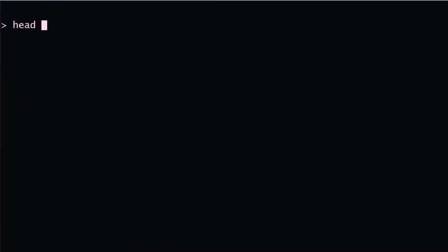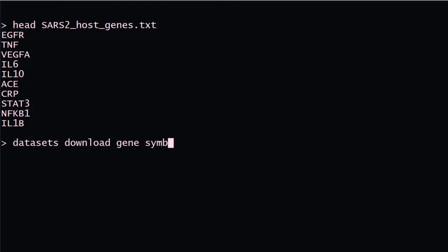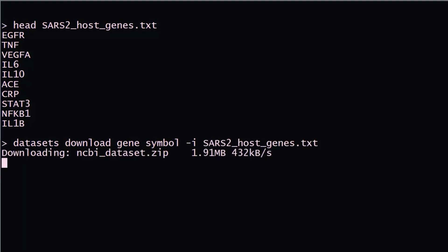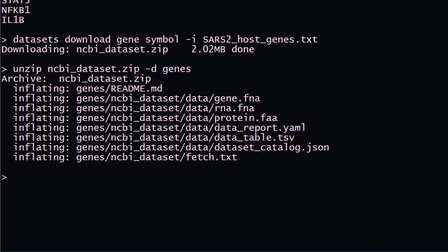In our example, we'll input a text file with a list of gene symbols. Here our input is a list of SARS-CoV-2 host genes. The command to retrieve gene data is very intuitive: datasets download gene symbol. You retrieve a structured zip file containing sequence and metadata, including gene FASTA, transcript FASTA, protein FASTA, and metadata in either TSV or YAML format.